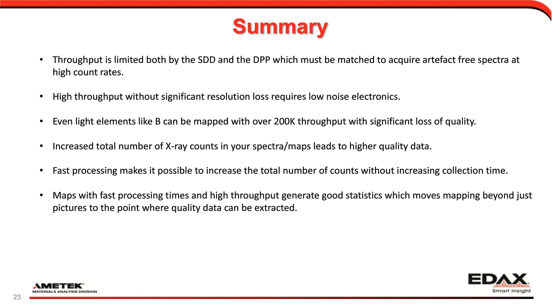When we have small inclusions that are just a few tens of pixels or so, high count rates will make the difference between determining what those inclusions are and just having them drown out in the noise of a low count statistic map. So again, high count rates can bring up those details in the spectra that you're not able to see for the same acquisition time at the lower pulse processing time.